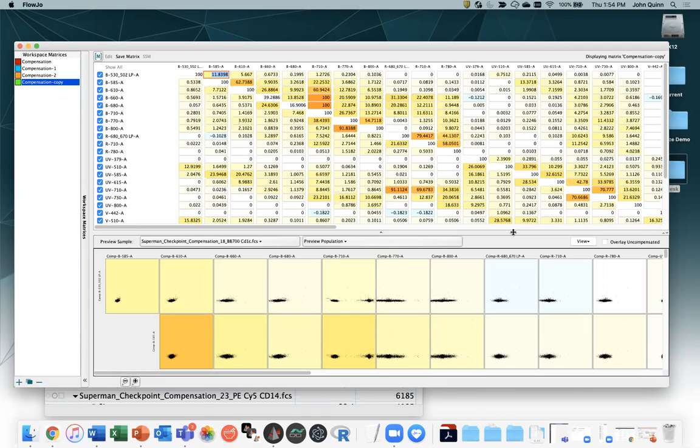Those controls are in there so that just in case, on generally smaller panels, someone has a fluorescent protein that is very difficult to create a proper compensation control for, that just biologically it's hard. You have some flexibility to go up or down 1% to correct for not being able to match your actual data particularly well, but we generally recommend against that, and we say it's getting to expert level compensation to be able to do that without negatively impacting the rest of your experiment.